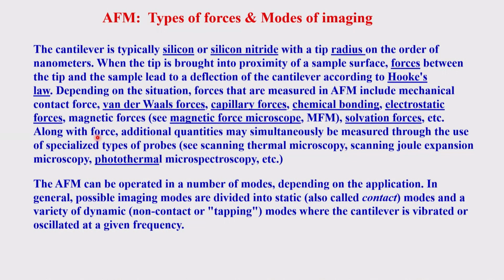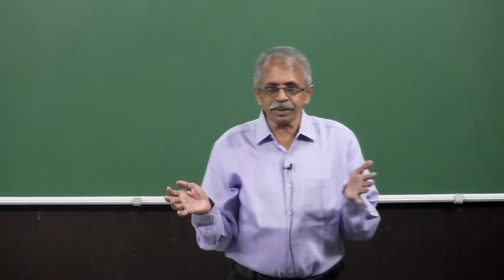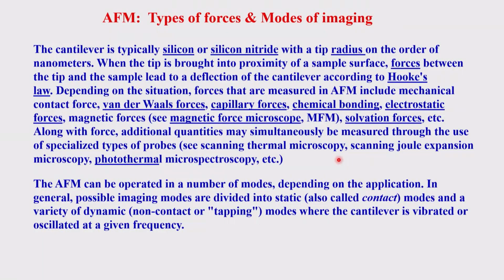So this will affect magnetic forces, solvation forces. These quantities may simultaneously be measured using the specialized force probe. Scanning thermal microscopy, scanning Joule expansion, photothermal, all of these come under the huge basket of the atomic force microscopy measurements.